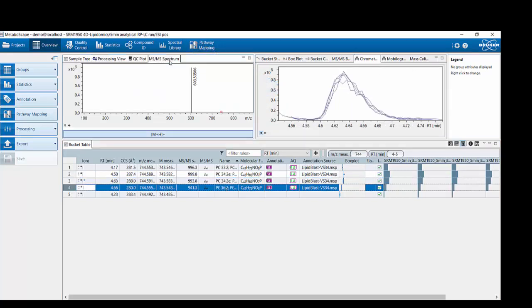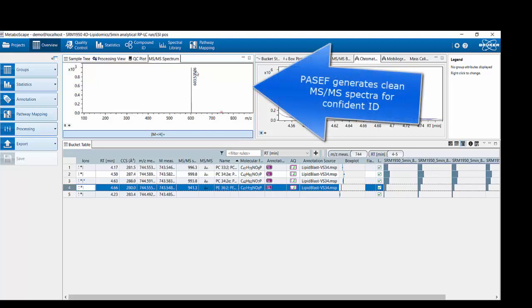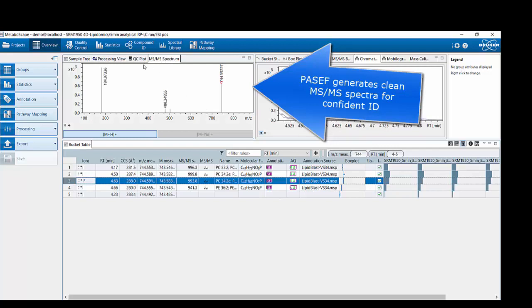Looking at the MS-MS spectra for the PE, we can see that the characteristic neutral loss of 141 is present, and the fragment ion of 603 is visible. Selecting the PC, we get a clear indication this is a PC lipid because we see the characteristic head group fragment of 184. Importantly, we don't get mixed spectra like before — where we applied data-dependent MS-MS without PASEF, i.e., without trapped ion mobility separation. Here we get really clean MS-MS spectra confirming both a PC and a PE species.